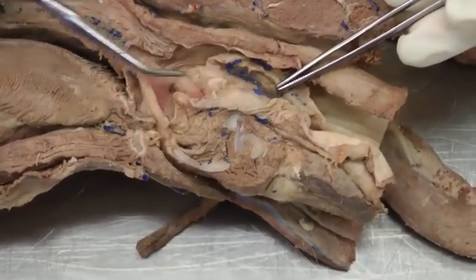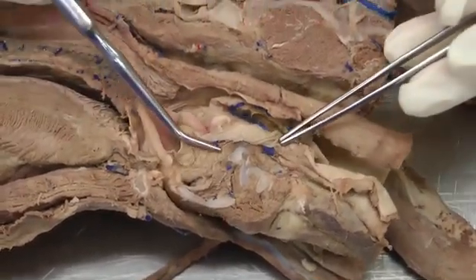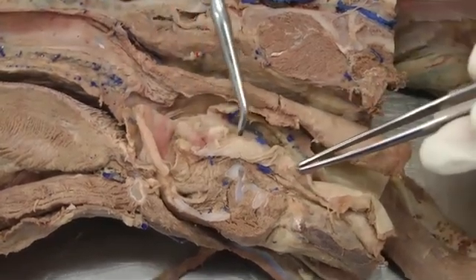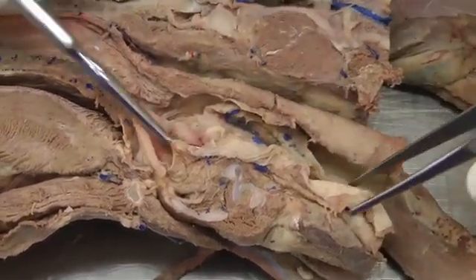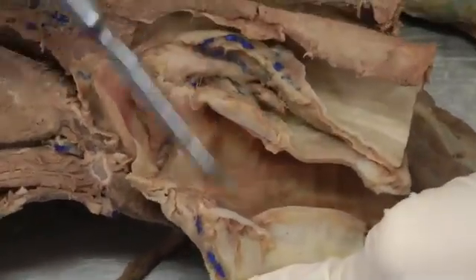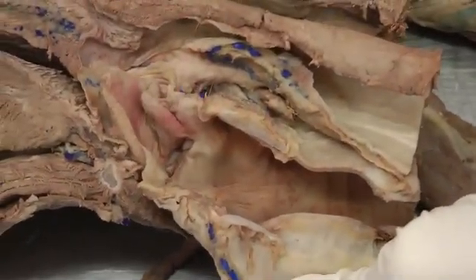The larynx is here, and if you do have it intact like this and you can't see inside the larynx, I recommend making a dorsal incision along the top and just opening it up so you'll be able to actually see inside the larynx and identify all the structures.